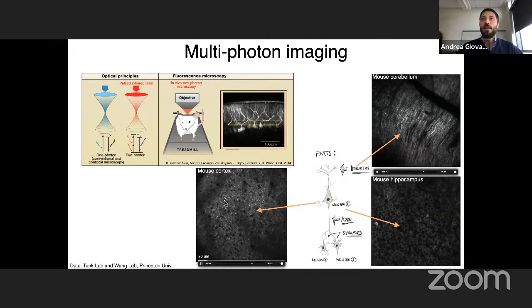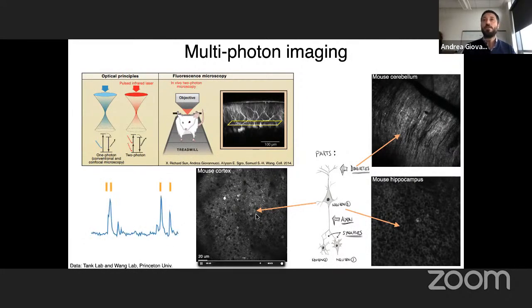And then you might actually have a mix of the two. In this case, you can see both neurons turning on, but also processes that turn on. So what you would normally do to extract the activity of calcium, you take one neuron, for instance, like this one, then you take the average of these pixels, and you will observe a fluorescent signal that changes with these dynamics. These dynamics reflect the intracellular calcium level of these neurons. So there is an indirect measure of the activity of neurons. And what you want to do now from these fluorescence traces is go back and resort to spikes. So at the end of the day, the result of your analysis of this type of movies is going from this raw movie to the spikes, the activity of each neuron.